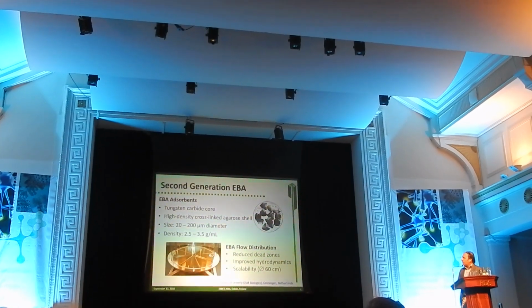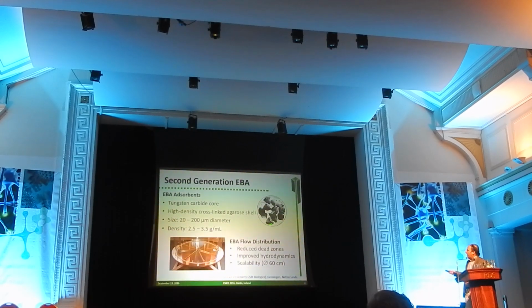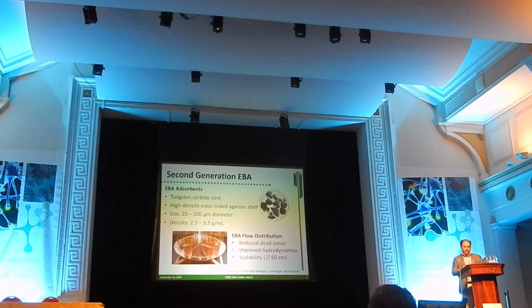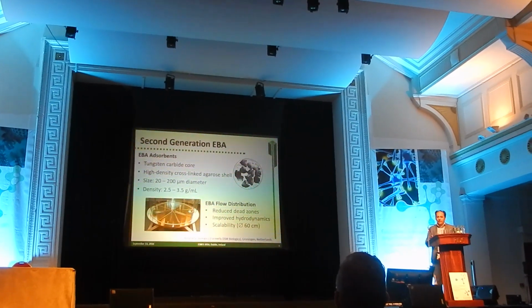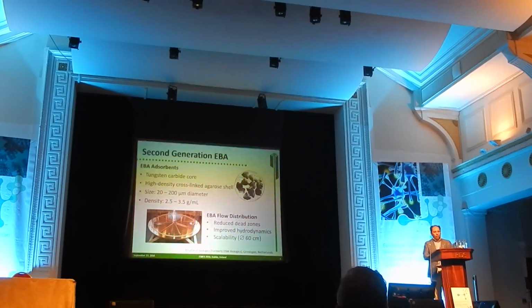And in recent years, we have seen the introduction of new materials, basically smaller and denser beads. All this is in agreement with theory, right? This is still a chromatography, so it's still a diffusion limited process, right?